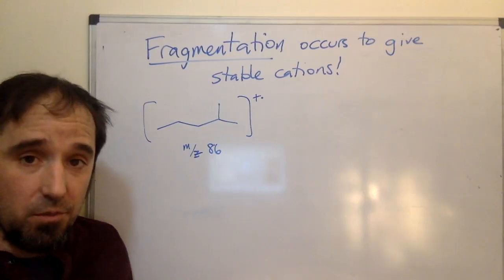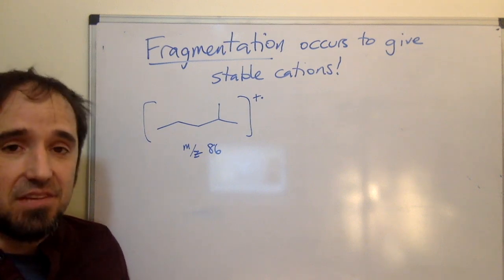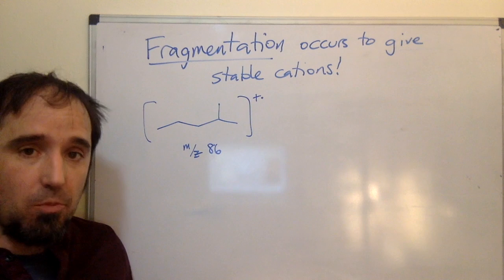One of the really important pieces of information is how these things break up, which can give us information about their structure.